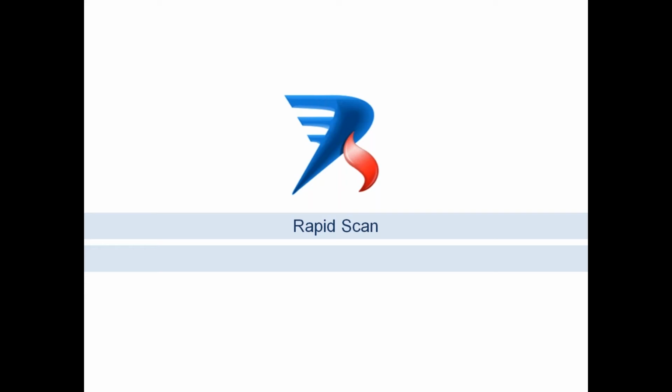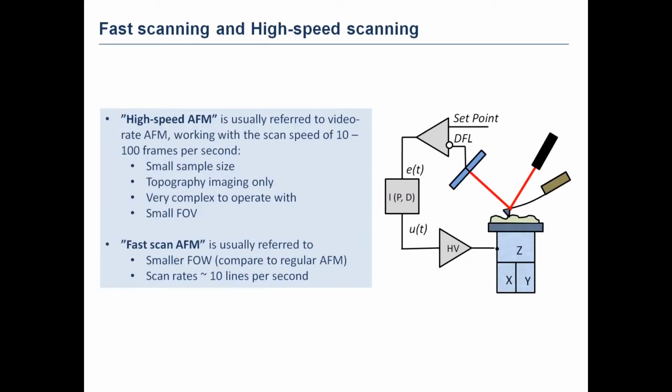Next point of today's talk is the RapidScan technology. Rapid, or so-called fast scan, is a topic in the AFM community that has been widely discussed for these last 10 years or even more. And there are two commonly used terms.